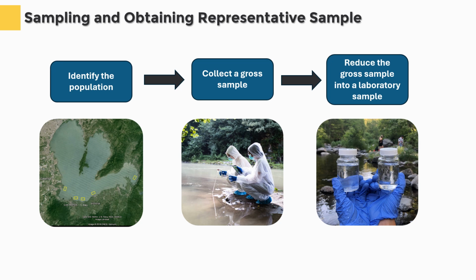The process of obtaining a representative sample for analysis involves selecting representative sampling units or increments, collecting them to form the gross sample, then reducing the size and homogenizing the gross sample to create the laboratory sample, and ensuring that both the gross and the laboratory samples closely resemble the average composition of the total material. These steps are essential for obtaining reliable and meaningful analytical results.